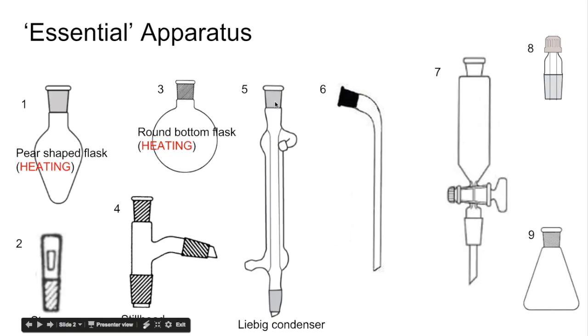The condenser attaches to the still head. You could put a stopper or a thermometer in there to seal up the apparatus. Number six is called a receiver adapter, which enables whatever is condensed in the condenser to be collected in a suitable collection vessel.